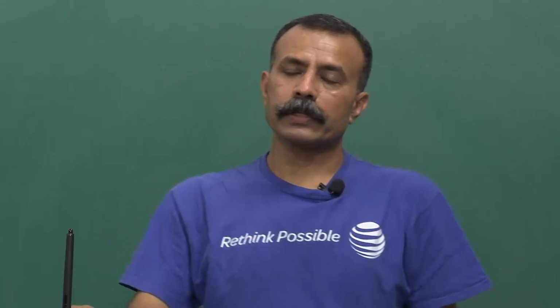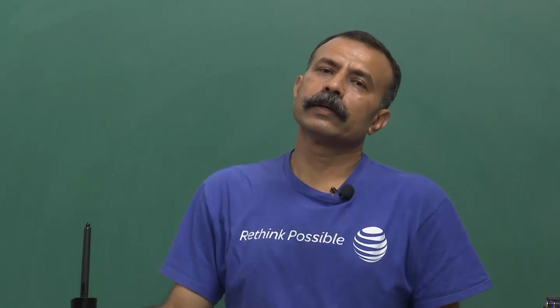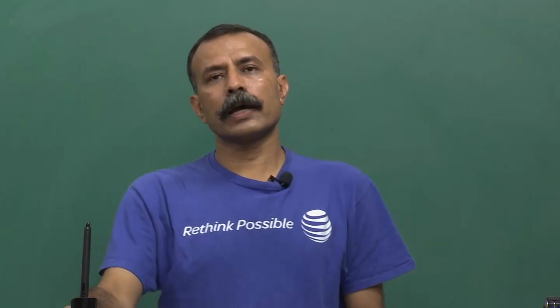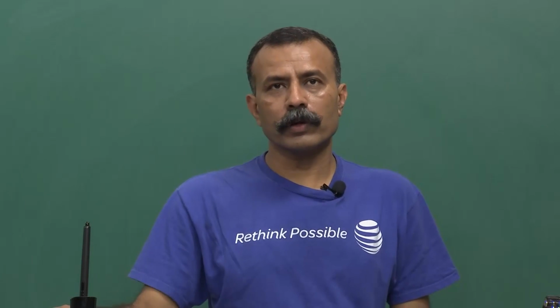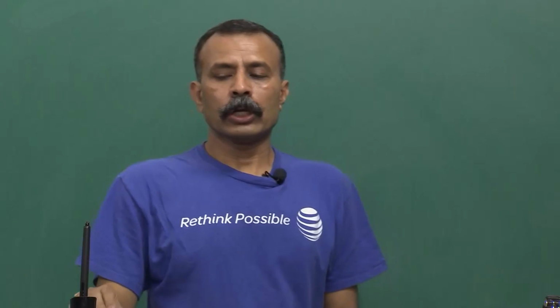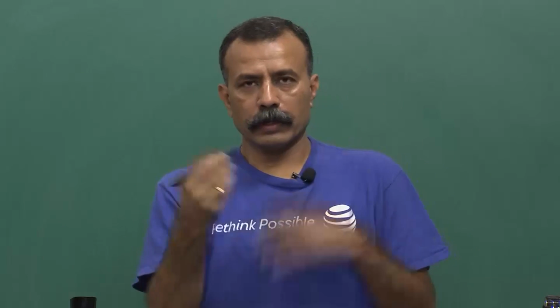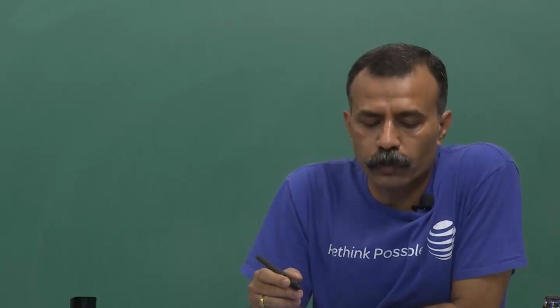So, today we are into the fourth lecture of the second week. Last lecture, if you recollect, we started talking about the design or the layout of the cell culture facility, and there are certain points which you have to keep in mind. So, today, let us first put that layout in front of us and keep on adding the components which we will be needing.